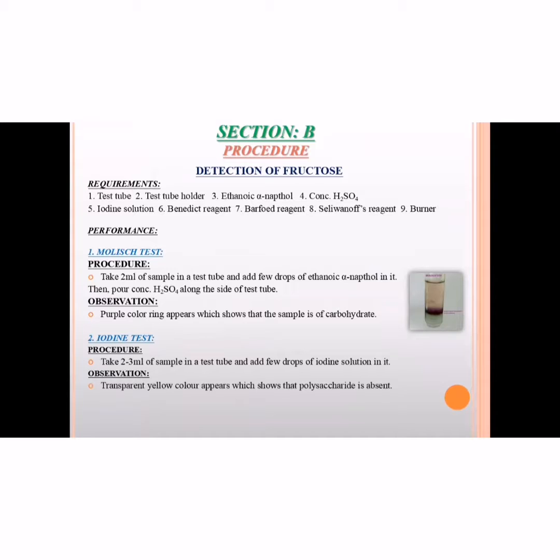For the detection of fructose, we have to perform different tests, and to perform these tests, we require a test tube holder, ethanolic alpha naphthol, concentrated H2SO4, iodine solution, Benedict reagent, Barfoed reagent, Seliwanoff reagent, and a burner. First, we will perform the Molisch test.